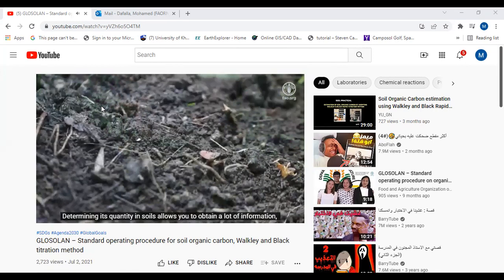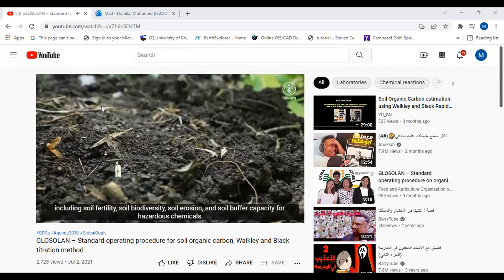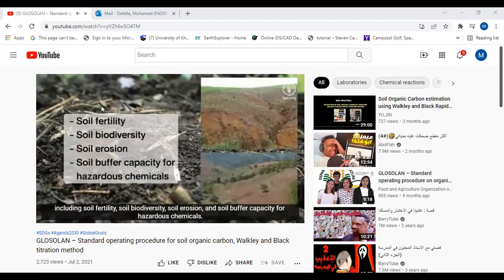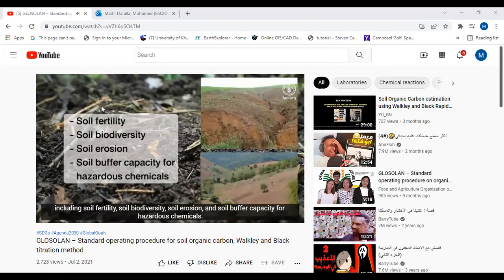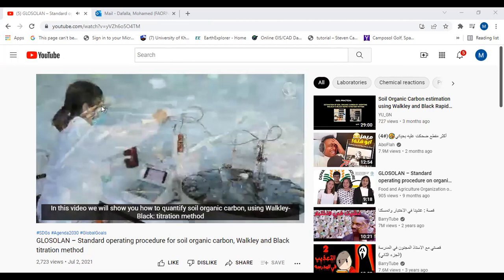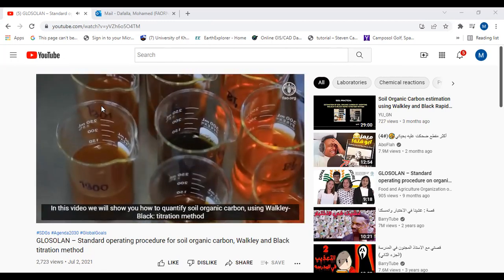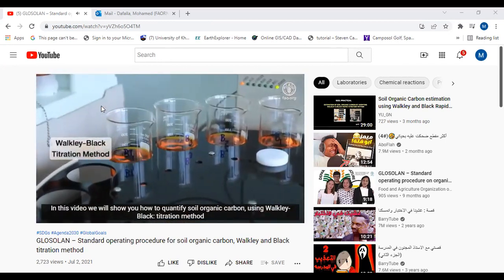Determining its quantity in soils permits deriving much information, especially on soil fertility, soil biodiversity, soil erosion, and soil buffer capacity for hazardous chemicals. In this video, we will show you how to quantify soil organic carbon using the Walkley and Black titration method.